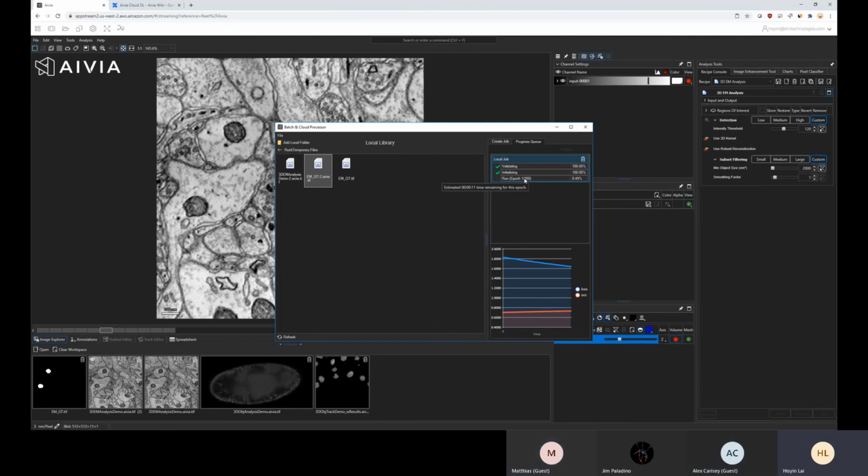Each epoch will be its own model. The idea for deep learning is that you want to converge the model to a high accuracy or a low loss rate. Once it gets to that point, you can spend another couple of hours running additional epochs and it might not change all that much. So you can always end it a little earlier, take the model and run with it.